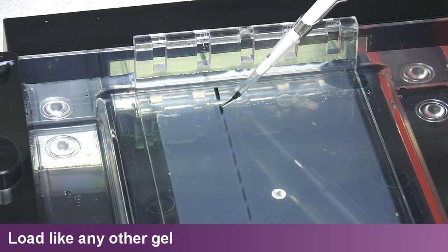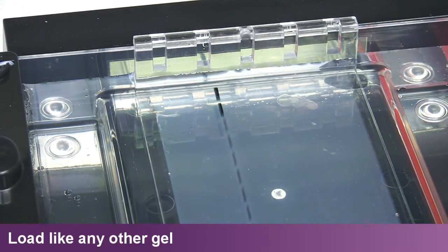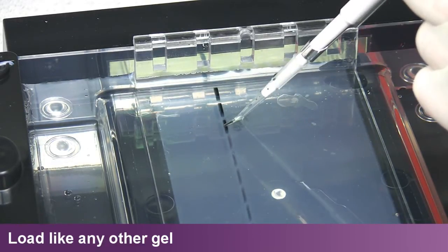Samples are loaded directly into the wells within the gel, as shown here with DNA pre-mixed with RunSafe stain.